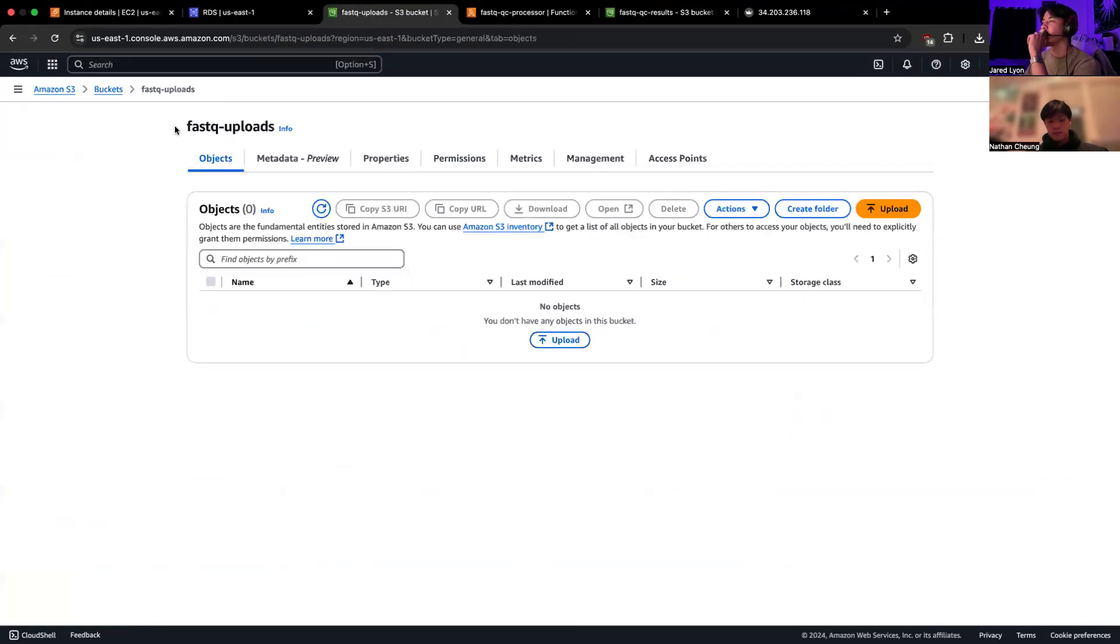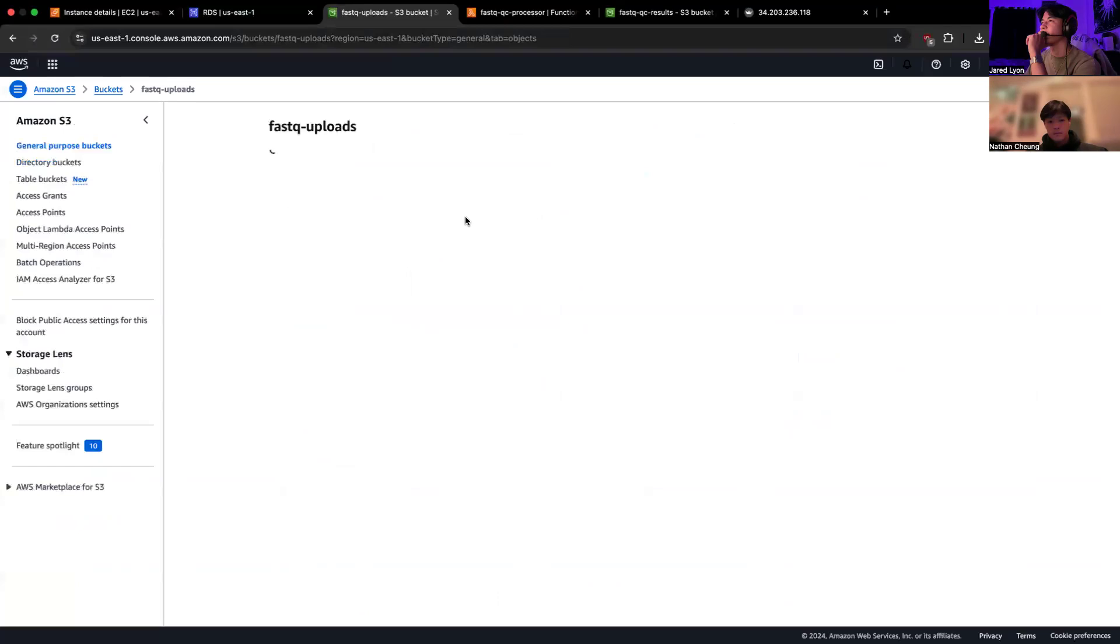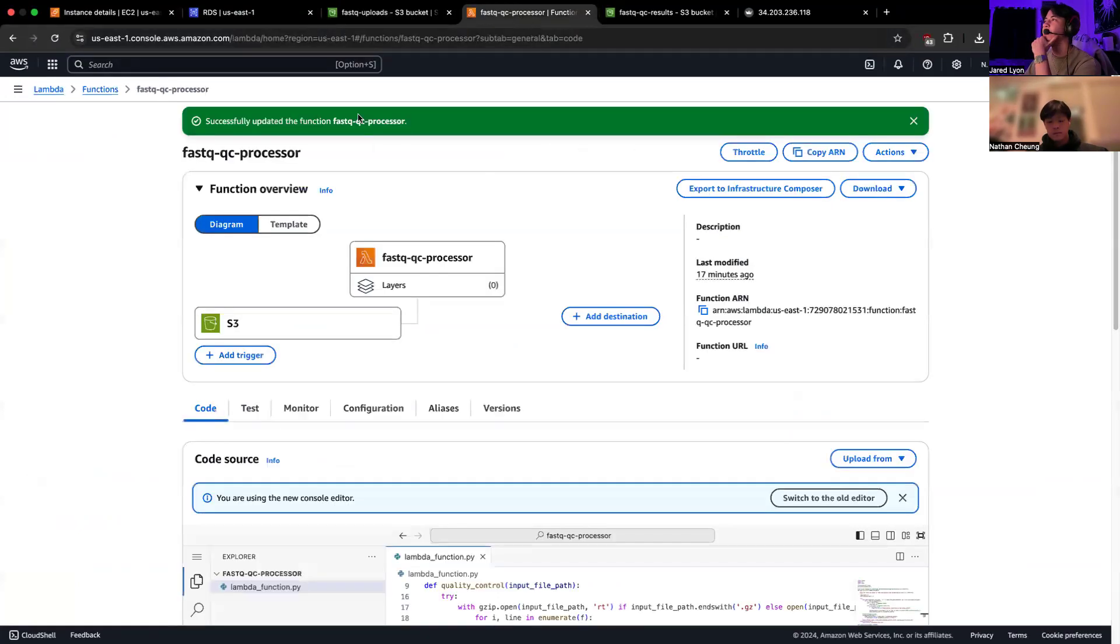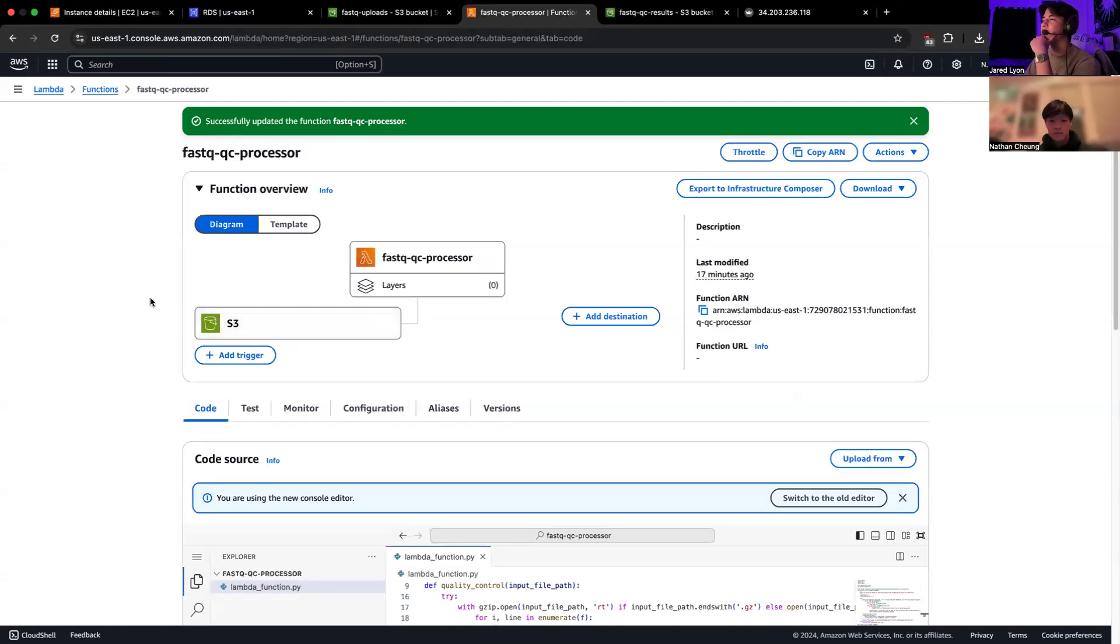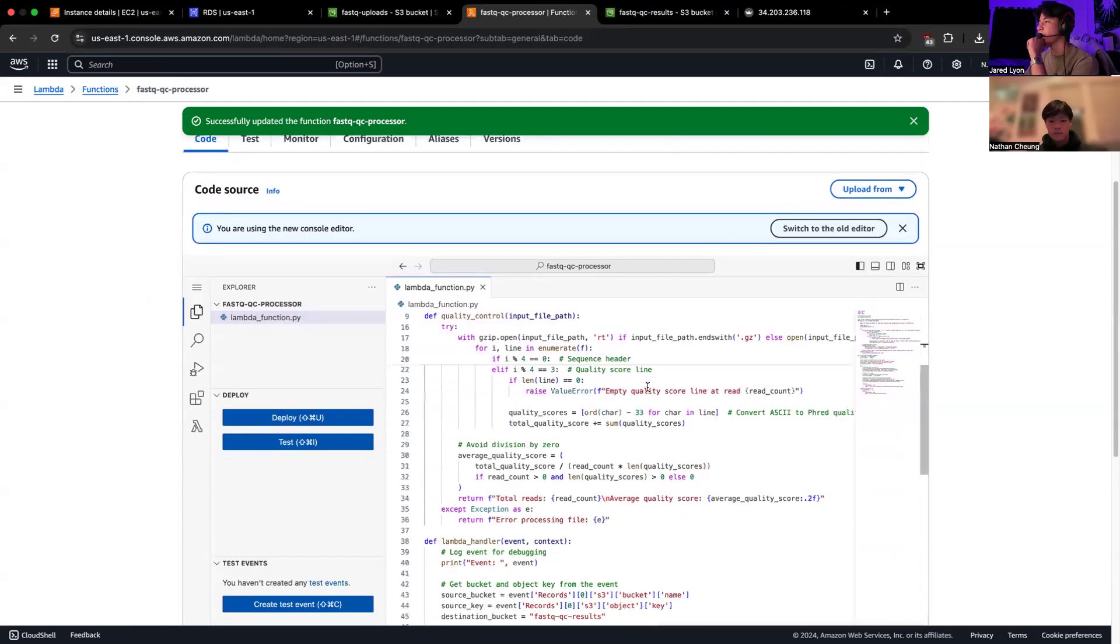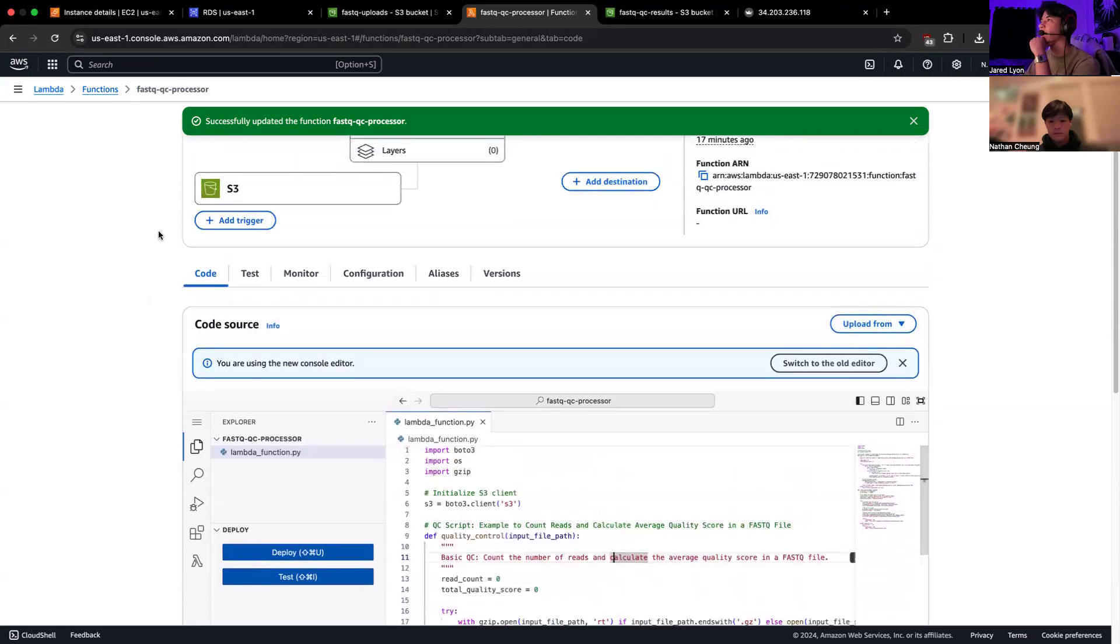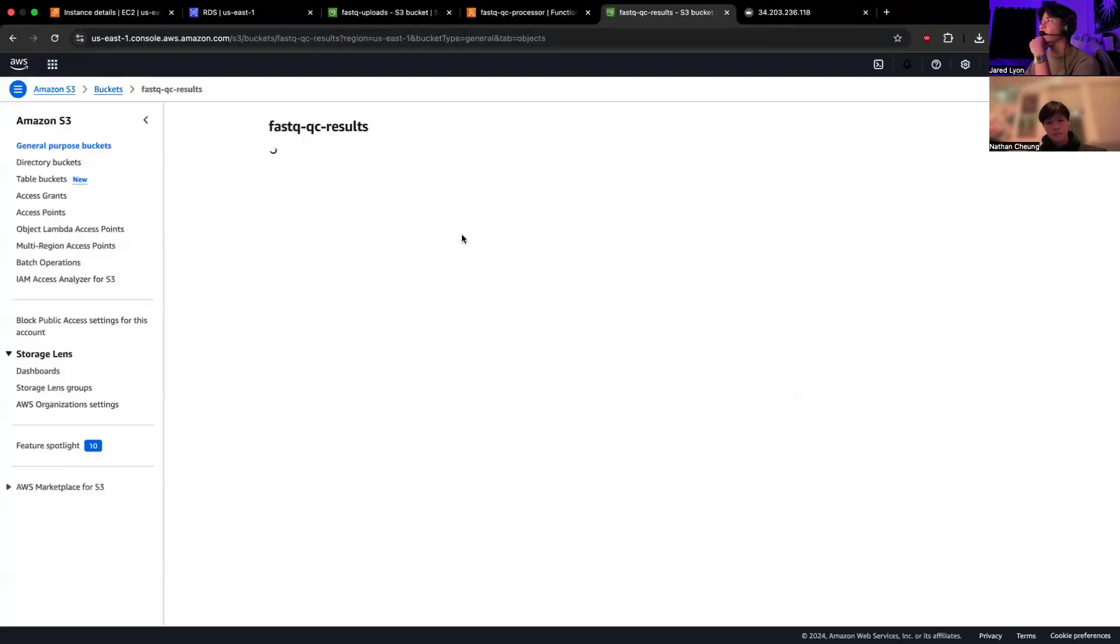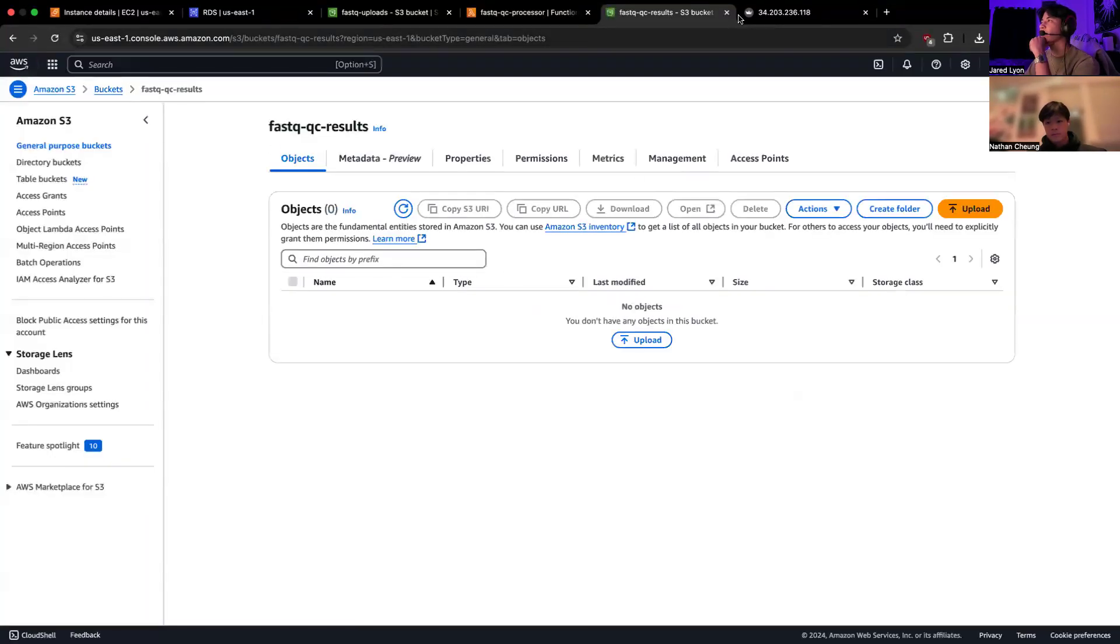And then here's our first bucket. As you can see, there's nothing in it right now. This is the FASTQ uploads bucket, where everything gets put in. And then we have our Lambda function, which is triggered by any new object created in that bucket that you just saw with our code implementation for quality score and line counting. And then this is the output bucket, FASTQ QC results. As you can see, there's also nothing in here.